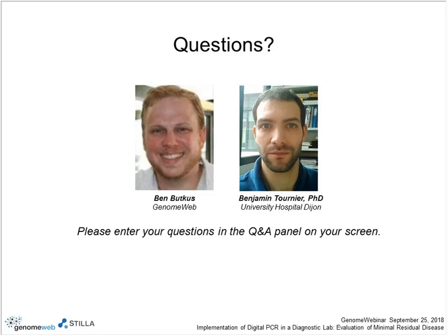The first question: why don't you use double spin before freezing as recommended by many authors?